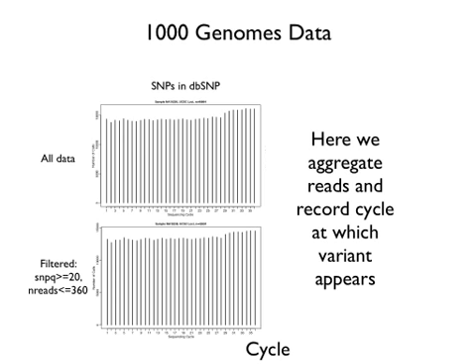So I'm only showing you here the ones that were known, the ones that were in dbSNP. And then I can go back to the original reads of the 1,000 Genomes data, and I can ask, this information that tells us this is a SNP comes from reads, and I can check for each read where the SNP lives, where on the cycle it was. Every single SNP in every single read is in some location within the read.